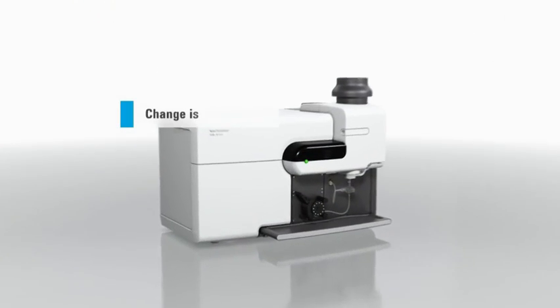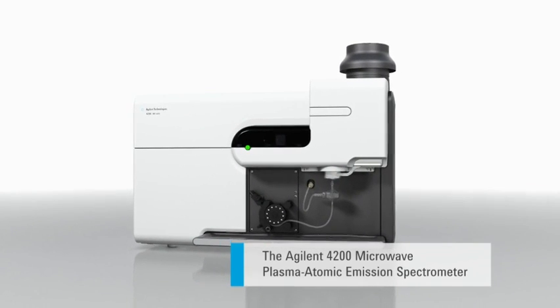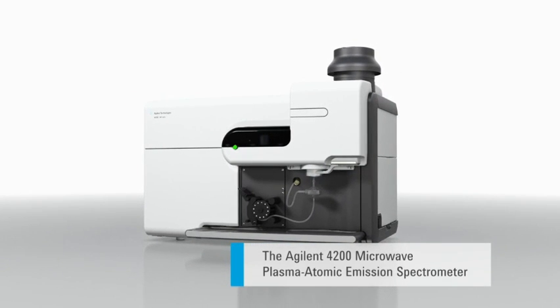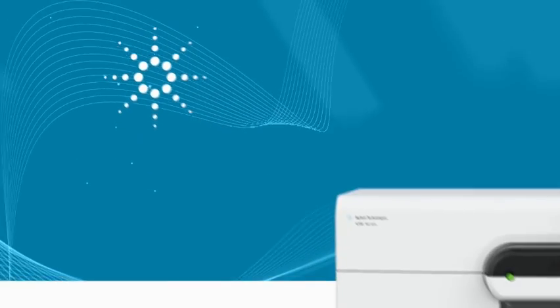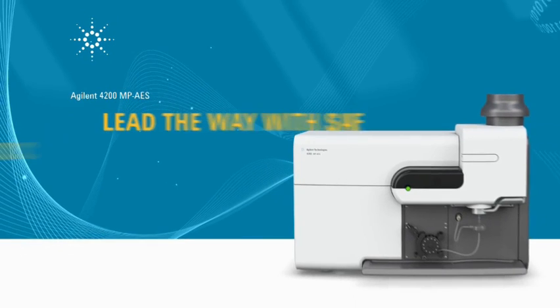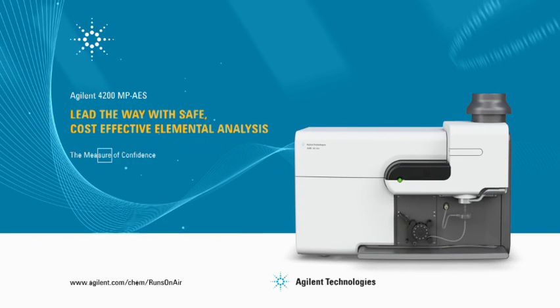Change is in the air. The Agilent 4200 Microwave Plasma Atomic Emission Spectrometer. Lead the way with safe, cost-effective elemental analysis. The 4200 MPAES will put you on the path to success!